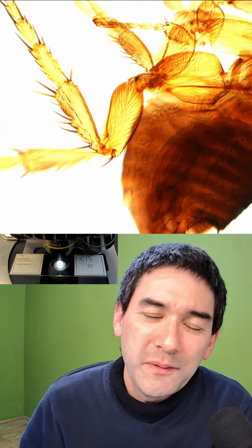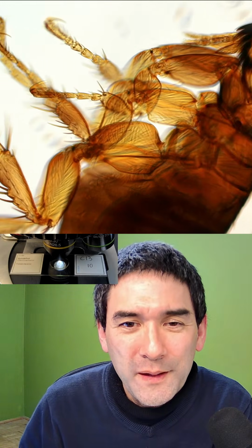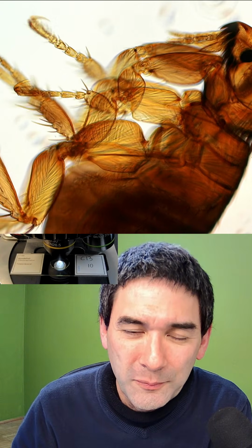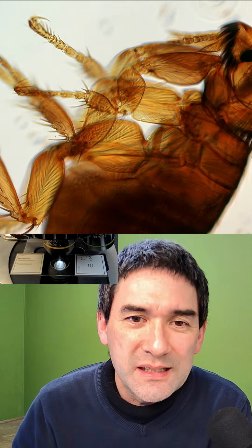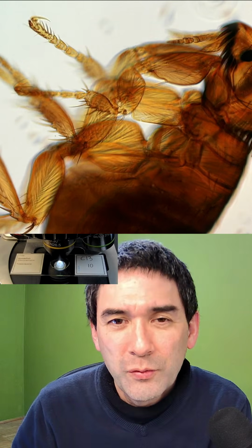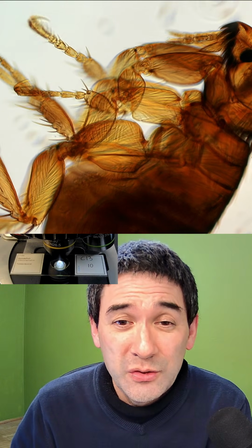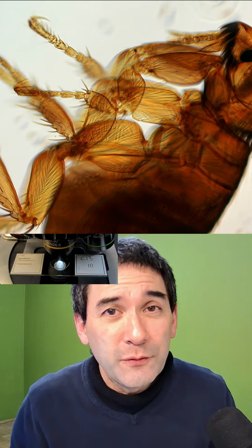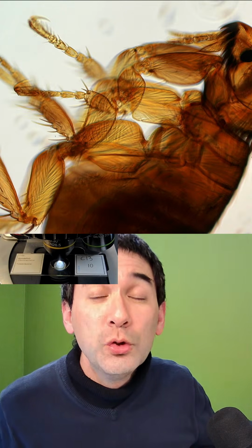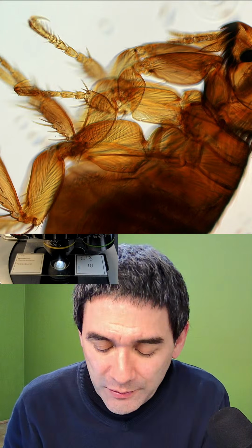Usually when making those whole-mounted slides, they're not so difficult to make, really. But the problem with them, as always, is that in many cases the specimen is too dark. It won't allow any light to go through, and then you don't see any details. So in many cases, those insects have to be bleached a little bit. There are a variety of ways you can do that. Potassium hydroxide, for example, is quite common. You can apparently also use lactic acid to bleach them, though I've never tried that. And some mounting media, like for example Euparal, are also suitable for brightening them up and clearing them.